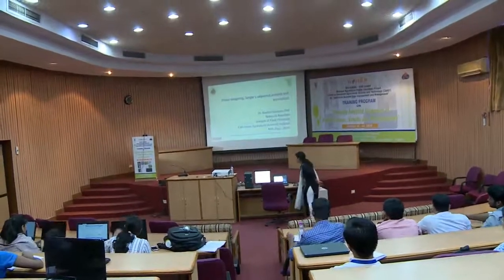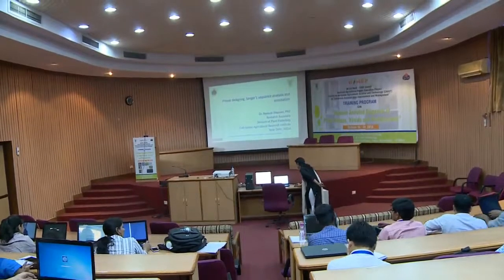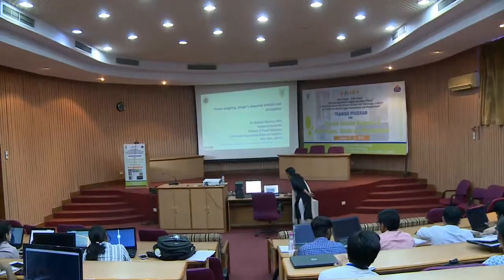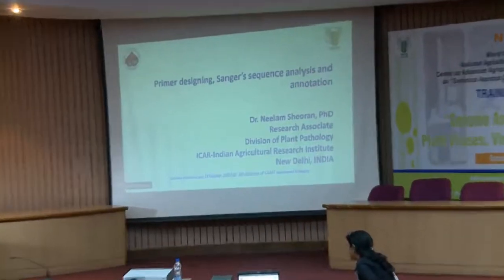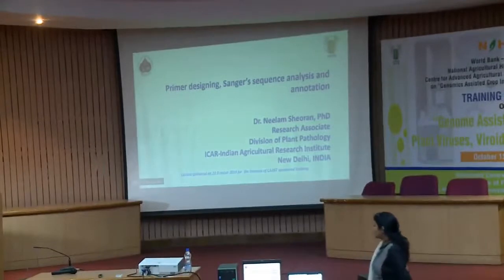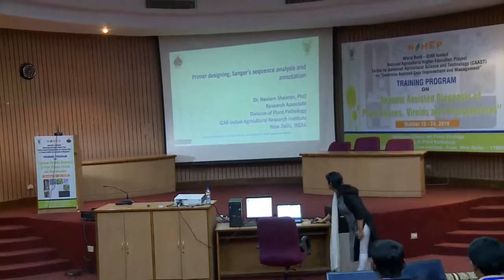I'll just show you how to do it. So, when you Google Primer3Plus, this is the first window that will come.